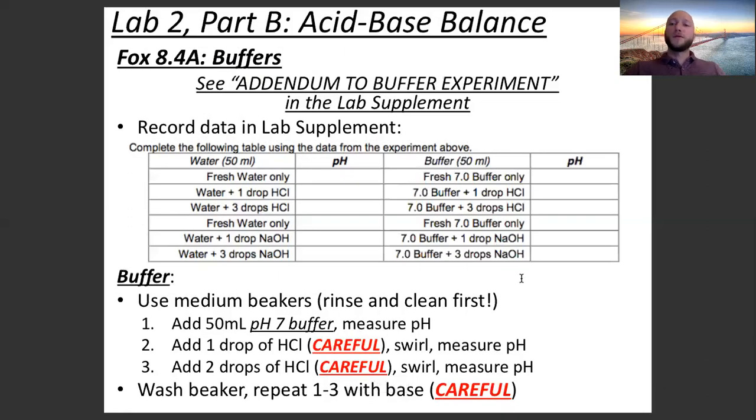We're then going to do the second half of this experiment, where it's the same experiment. The one thing that we change is, instead of using pure fresh water, we're using a buffer. What do buffer solutions do? Think back to chemistry. What do buffer solutions do? How would this experiment be different if we used a buffer solution and added HCl or NaOH to that buffer solution?